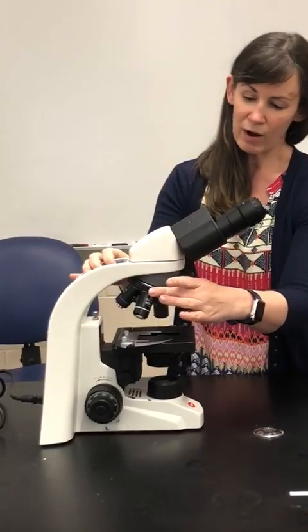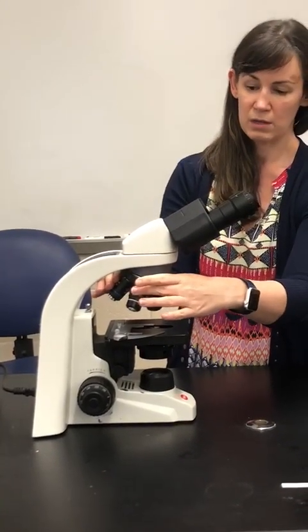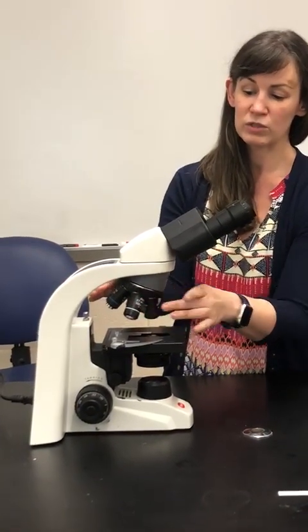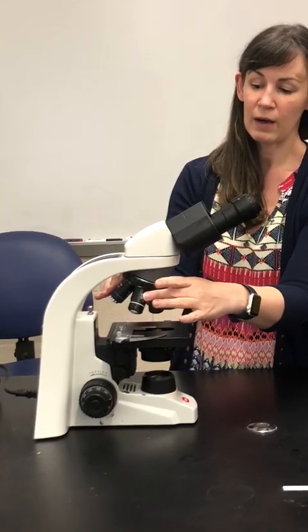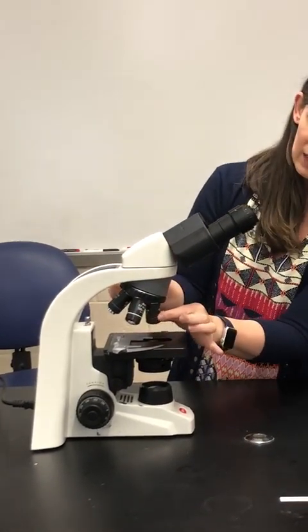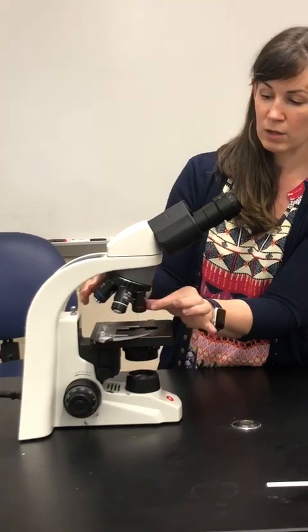Down here we have our revolving nose piece that has 4 different objectives on it. So these are where our other lenses come in, and we have several different strengths of lenses that can allow us to see different sizes of specimens. Here in red is the 4x objective. This is also called the scanning objective, and this is the lowest power objective that we have.